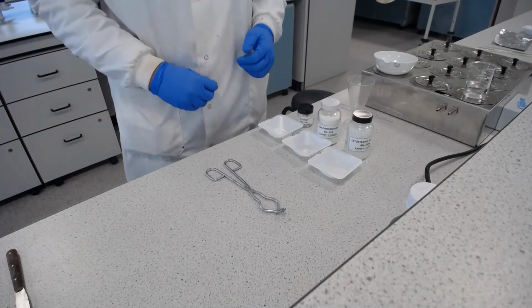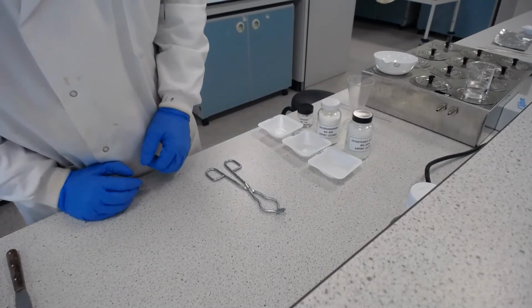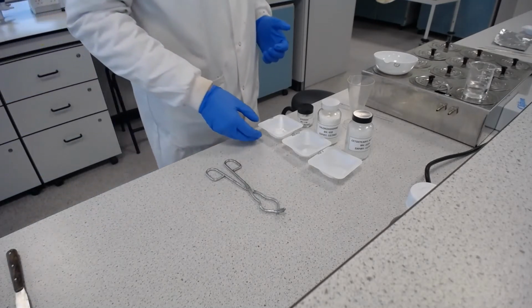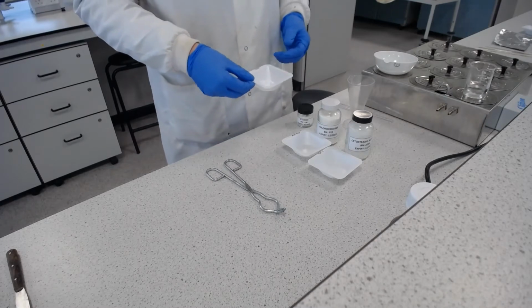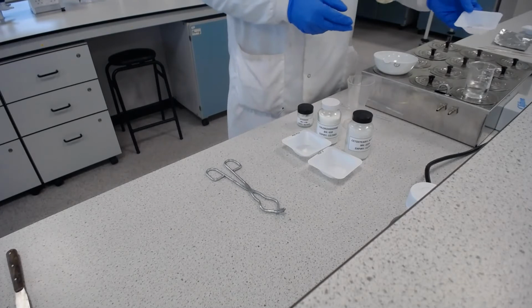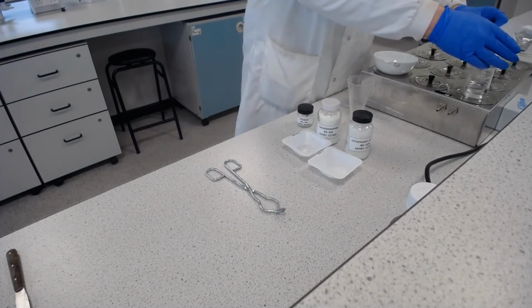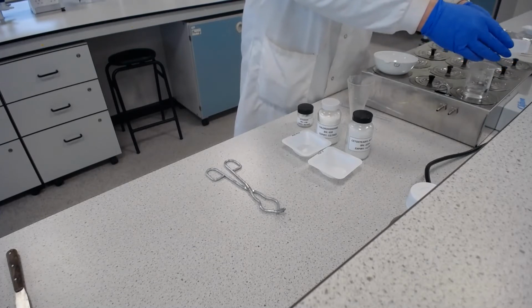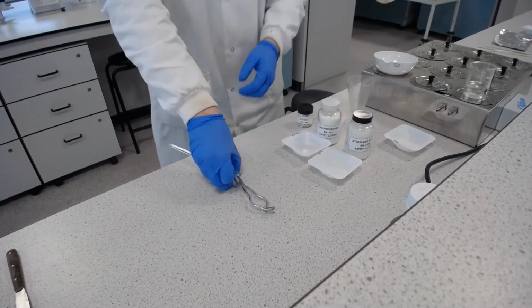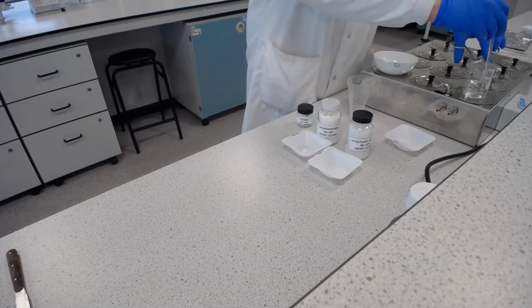Now at this stage, now the water's getting nice and warm, we can also add in the cetramide to the water and then the chlorhexidine. So there isn't very much cetramide or chlorhexidine. So when it says to add gradually, you probably won't be able to add it in more than a couple of goes. But I'm just going to put about half of that in there. Cetramide. And I'm going to give it a stir with the glass rod. That might be quite hot, so I'm just going to use the tongs to hold it.